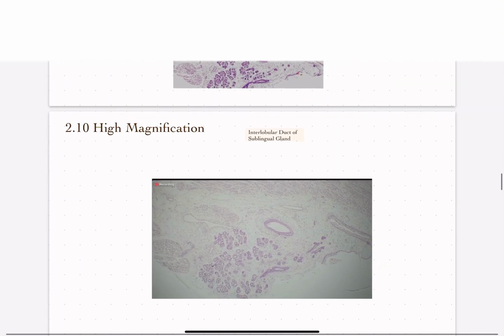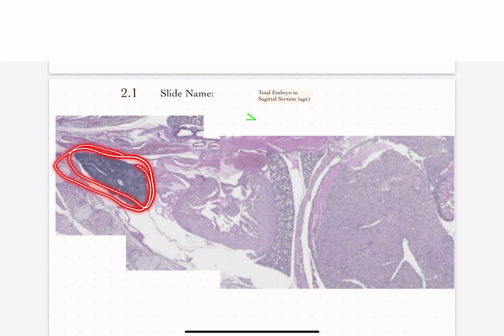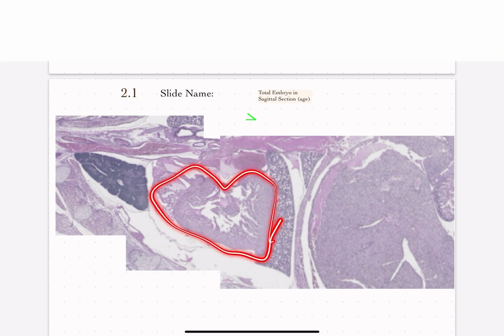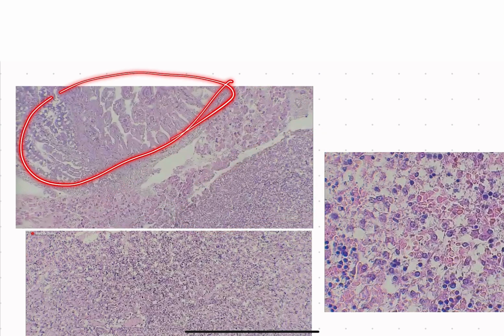Okay, going into the answers more in depth now. All right, let's go through the structures. Now, like we said in the first test, we could see the thymus here, which is a very dark color and helps us recognize that we're in the upper thorax of the embryo. We can also see the developing ribs here as well. This would be the heart, only very segmented, and then we have the diaphragm, the lungs, and the liver right there. Zooming in, this would be a section where we can see the liver, we can see the pancreas, we can even see some sort of intestinal loop or recanalization happening there.